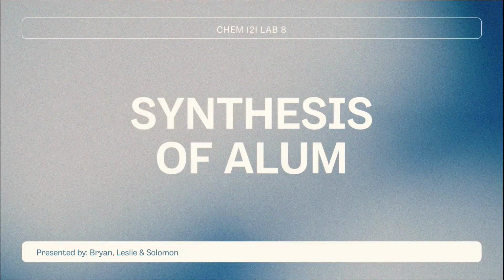Hi everyone, today we'll be presenting our results from Experiment 8, the synthesis of alum. This experiment demonstrates how a common industrial compound can be synthesized in the lab and verified through various analytical techniques.